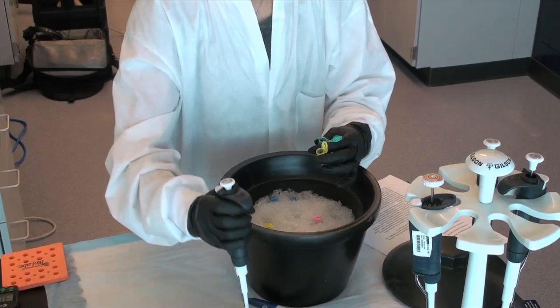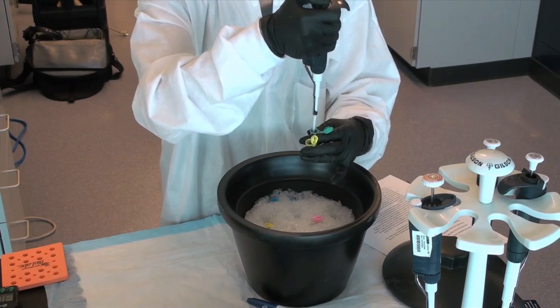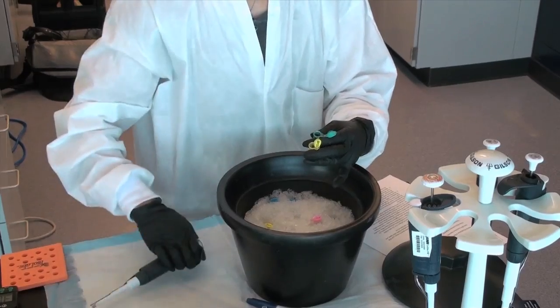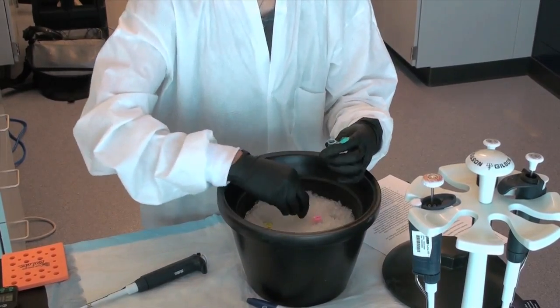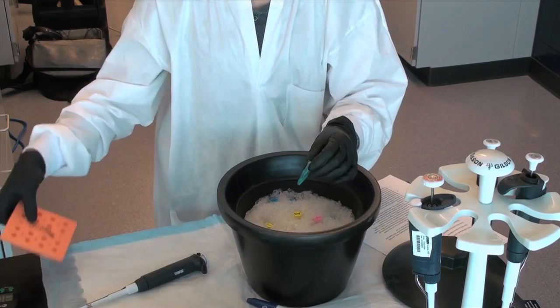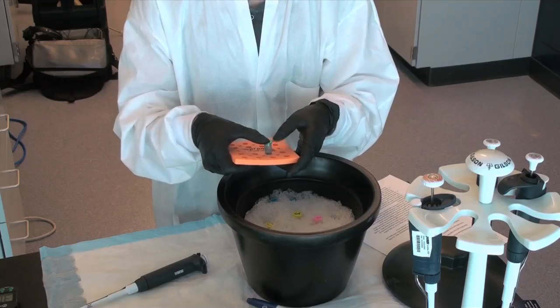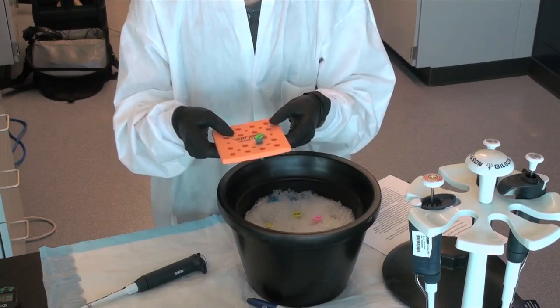Step 5: To dephosphorylate the vector, we will use the enzyme antarctic phosphatase, which will prevent the vector from recirculating without any insert. To do this, we will add to the vector tube 5 microliters of 10x antarctic phosphatase buffer, 4 microliters of water, and 1 microliter of antarctic phosphatase.